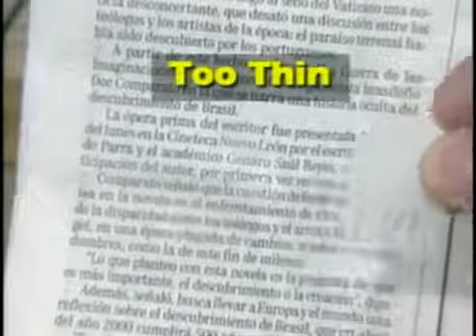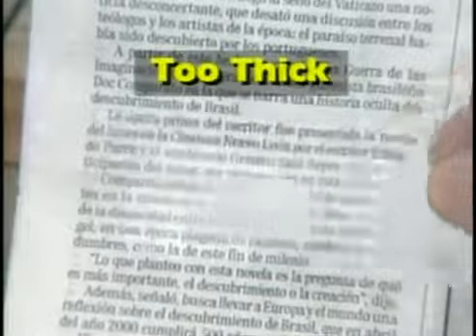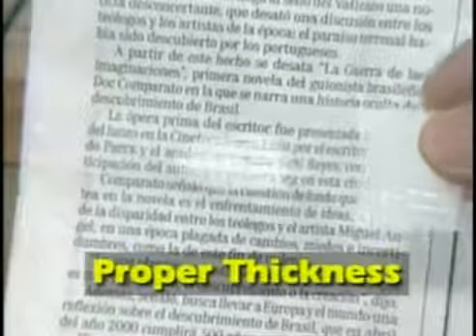How can you tell you have the proper thickness? If it is too thin, the specimen may yield false negative results. If it is too thick, the smear may wash off the slide during the staining procedure. Newsprint can usually be read behind a dried smear when it is the proper thickness.